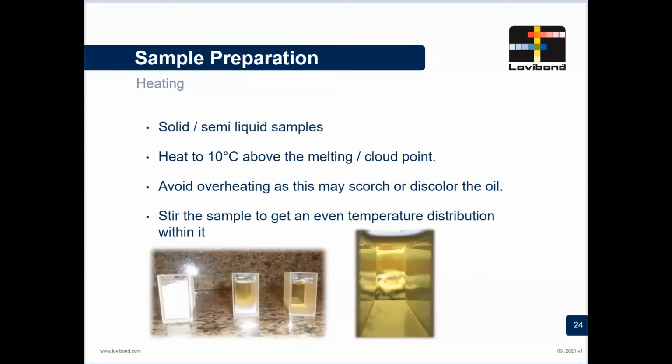Now, having a nice clear sample doesn't always tell us the whole picture. You may need to do a little bit of experimenting to find the right temperature to heat your sample, especially if you've got a palm oil. I will come back to that in a minute. Having said that about heating, we're going to want to avoid overheating, as overheating may scorch or discolor the sample. You probably need to be most careful about this if you're using a microwave to heat your sample. You're going to need to determine for yourself, with your particular microwave, how many seconds is going to give you the right temperature for your oil.